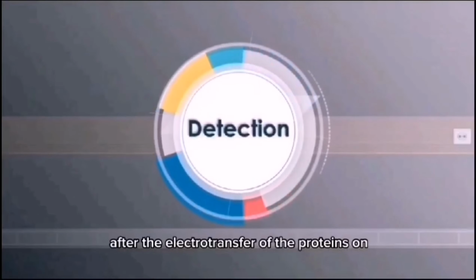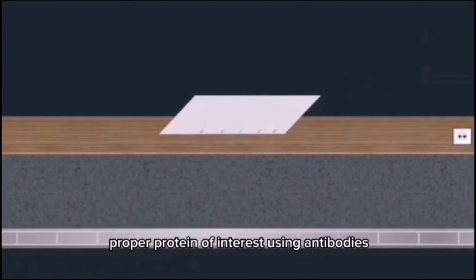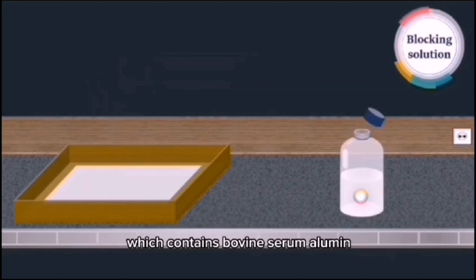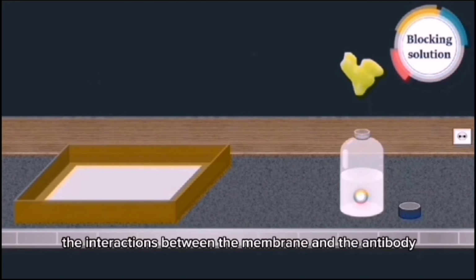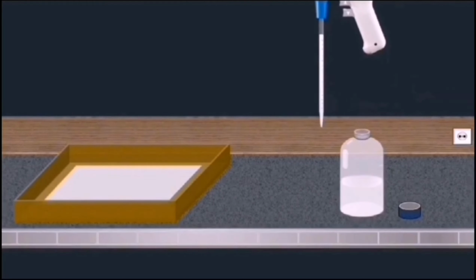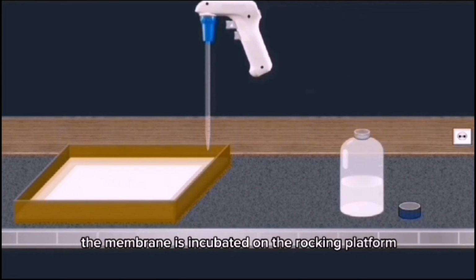After the electrotransfer of the proteins onto the membrane, the next step is the detection of our protein of interest using antibodies. First of all, the membrane is soaked in a blocking solution which contains bovine serum albumin. This step must be taken to prevent interactions between the membrane and the antibody used for the detection of the target protein. Once the blocking solution has been added, the membrane is incubated on the rocking platform.